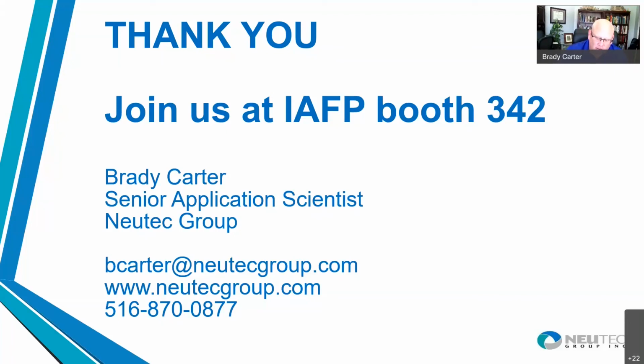So the samples that are going to be used for testing need to be protected, put in some sort of a barrier, and the cups that are used for our water activity instruments have lids to provide just that protection. But yes, certainly when product is exposed to any kind of an environment, the relative humidity of that environment is influencing the water activity. And Brady, how important are ingredients in determining how well a product is produced?